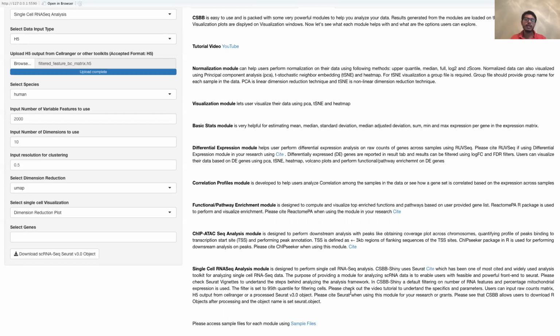For the first preliminary analysis, you should use very minimal or less stringent cutoffs so that you can see the overall data, and then dig in and remove more cells from it.